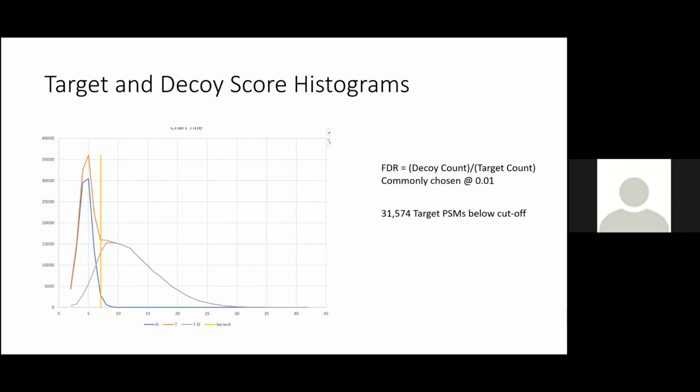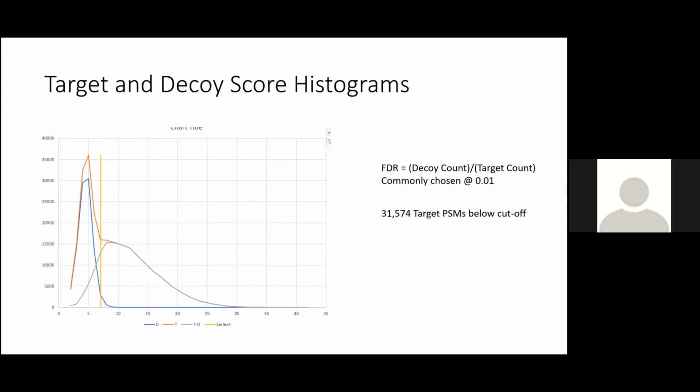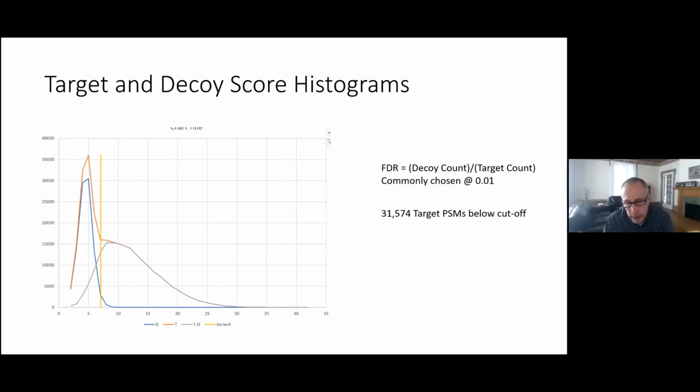And then I was also thinking that it depends on what we're doing with the data downstream. So if these identifications are going to be validated, then you could maybe even accept a very high false discovery rate because you're going to validate it eventually. Sure, absolutely. And we haven't really talked about, like I said, there are individual confidence metrics. And so then you can stop thinking about this group-wise confidence metric and think about the individual peptide confidence metric if you want to switch around. Which goes towards your point about individual validation, right? If we're going to look at individual peptide assignments based on whether they're real or not, then that's a different set of peptides.